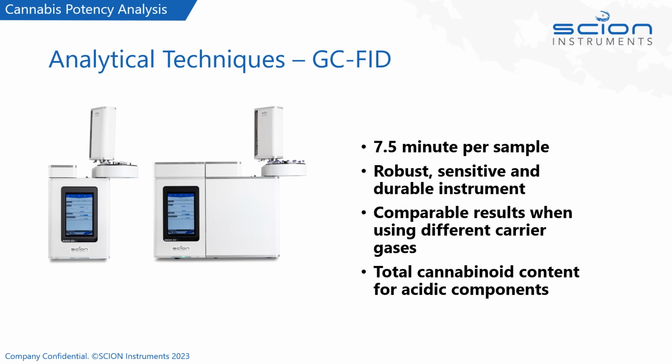The one drawback, as mentioned, for this technique was that without the additional sample prep, then for the acidic cannabinoids mentioned, it would have to be recorded as the total cannabinoid content.